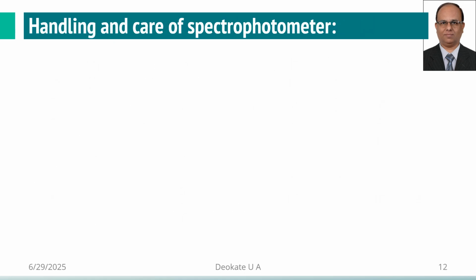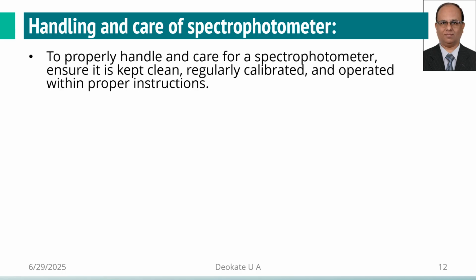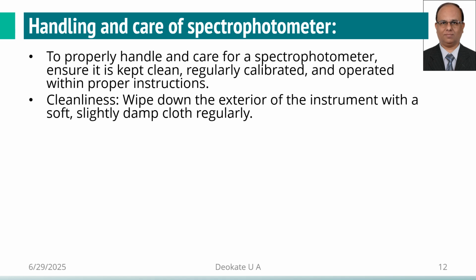If you have done all the preparations of solutions, now you should focus on handling and care of the spectrophotometer. To properly handle and care for the spectrophotometer, ensure it is kept clean, regularly calibrated and operated with proper instruction. You have to follow the SOP, the standard operating procedure.